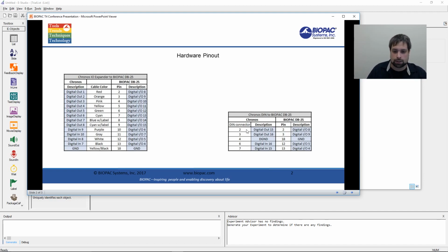So that way I can actually determine what the participant saw and line that up with everything that I have in my data stream, so I can time lock all of these things. So this is what's going to inform the pin that I set on the E-Prime or Chrono side of everything.